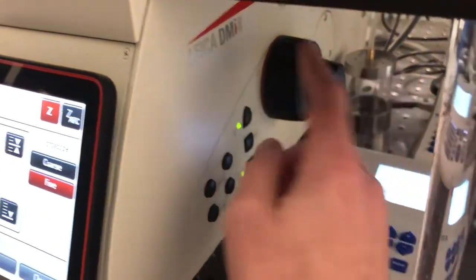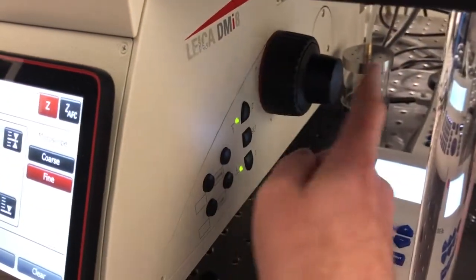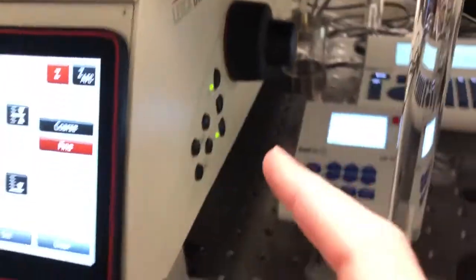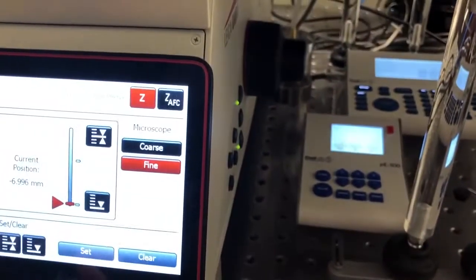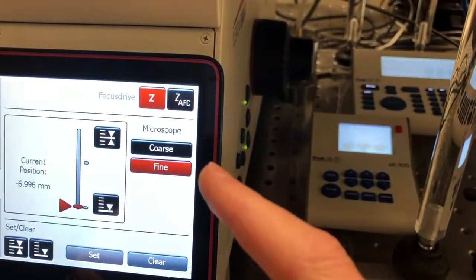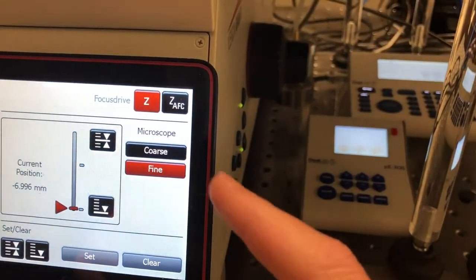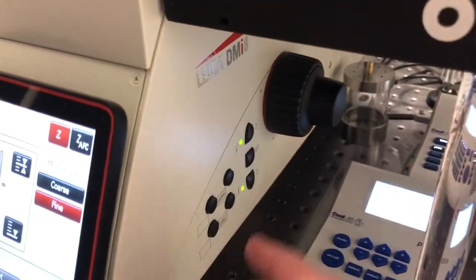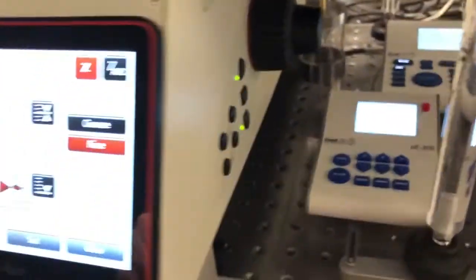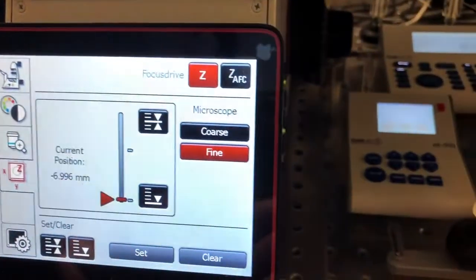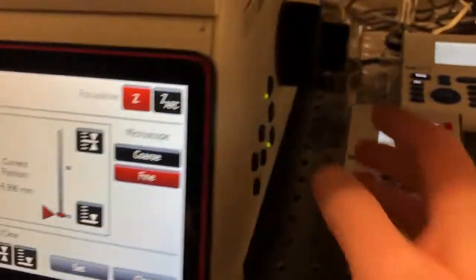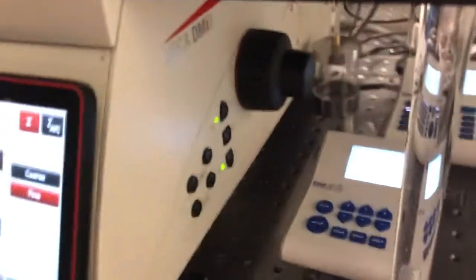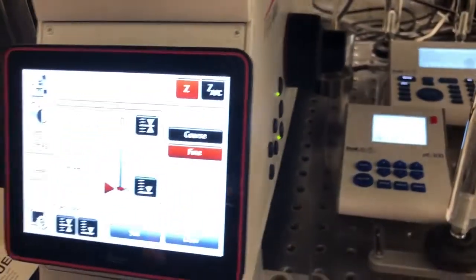So this is coarse, this is fine, but in addition they can be run in a fine mode where movements here on both of them lead to smaller changes, or in a coarse mode where movements here lead to bigger changes.